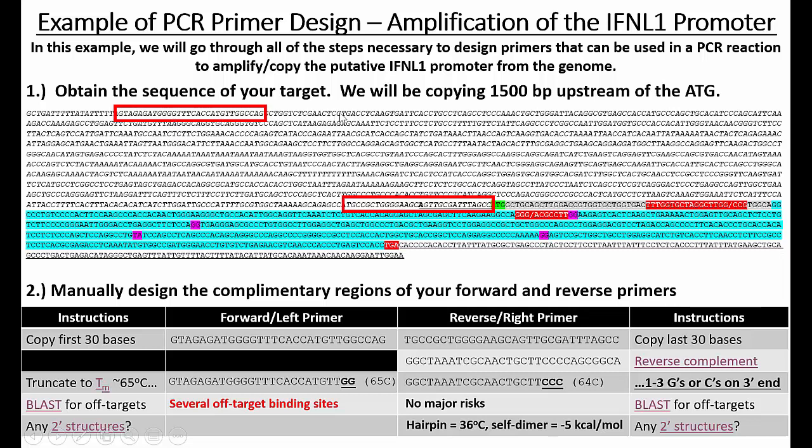Now, I've already done this. I did this example before recording this lesson, and what I found was that there's actually a large sequence here that is complementary to other parts of the genome. So that was painful. I had to check a lot of sequences. I had to do a lot of blasting over and over and over again.